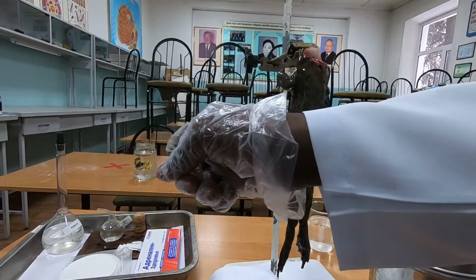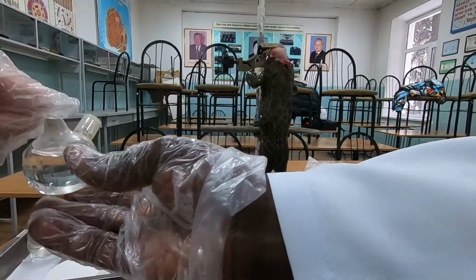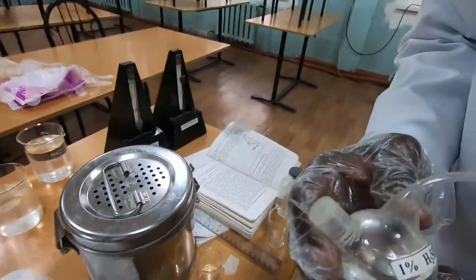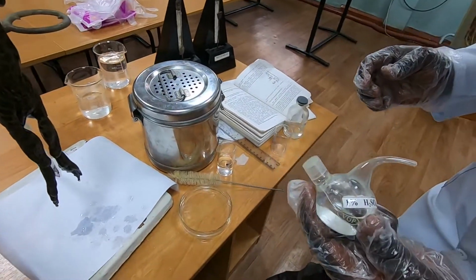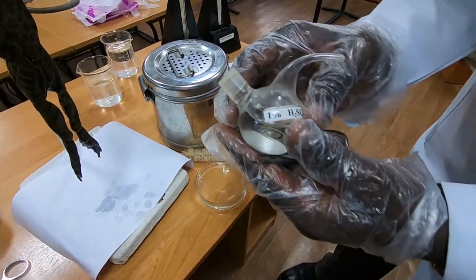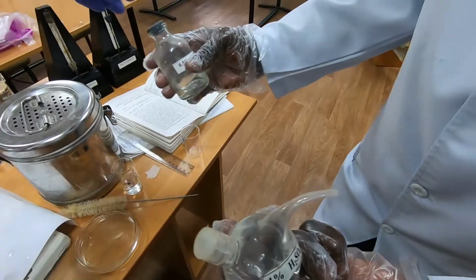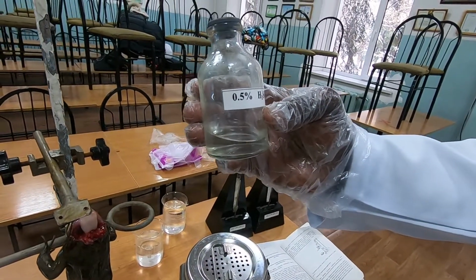Can you give me that acid, please? That's 1%. We used 0.5%, right?